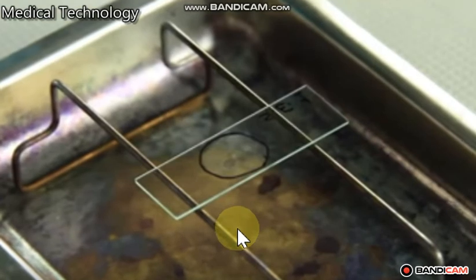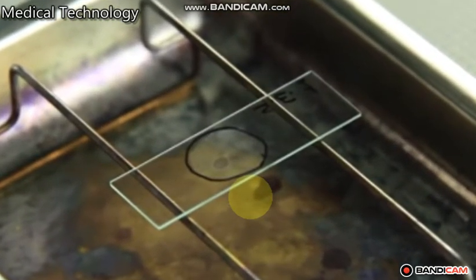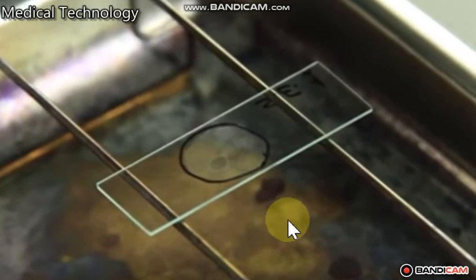Then let the slide dry without any source of heating.